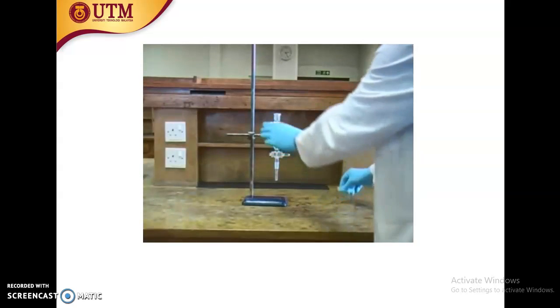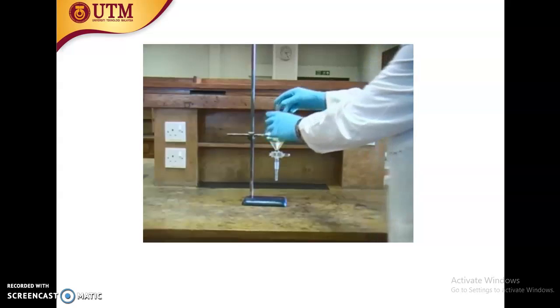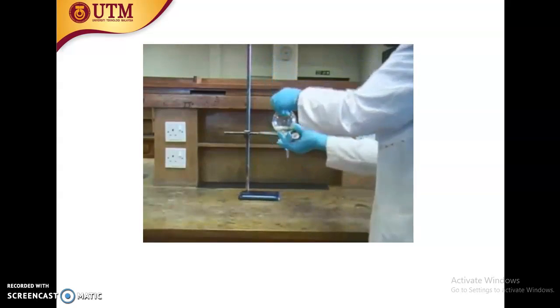Next, you need to place a stopper in the neck of the separating funnel, and you must ensure that you don't allow this to fall out at any point while you're handling the apparatus. Secure the stopper with one hand and carefully invert the separating funnel.